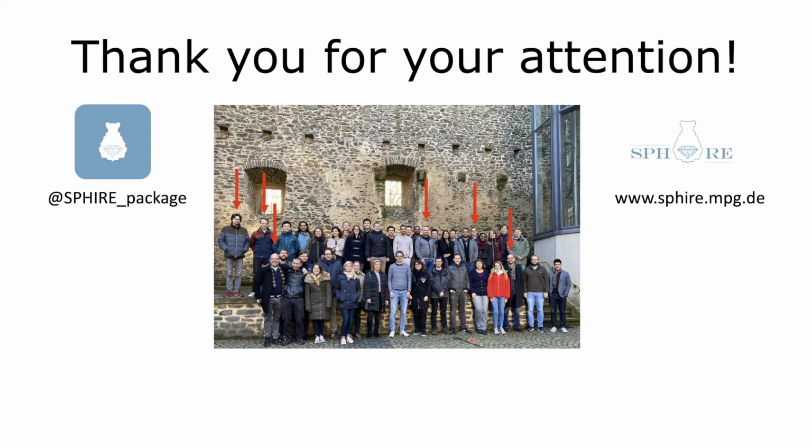In this dialog window, there's a bunch of checkable buttons for which of the jobs you want to rerun. For example, if you want to rerun the feedback pipeline, you click rerun feedback because you realize, my protein radius is way too small, this will never work, or that my pixel size was wrong or something. Or you can just redo motion correction.